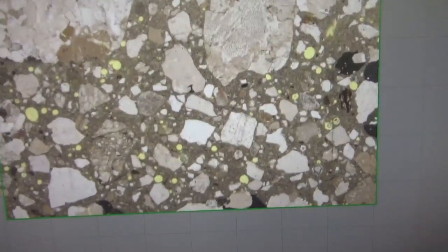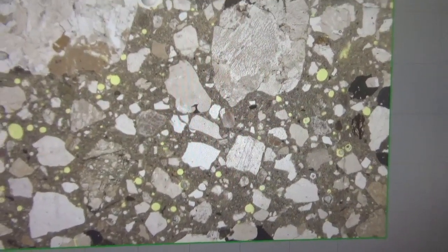So at the sharp focus, you get the maximum length of the horizontal bar with a blue line and a red line. The red line is the maximum length at the sharp focus of your horizontal bar, and the blue line is where your focus actually is. So you have to make sure that your blue line stays close to the red line. You get the maximum horizontal bar at the sharp focus.